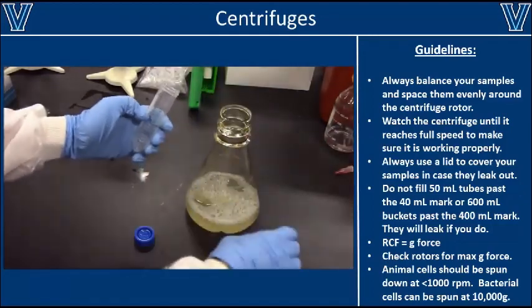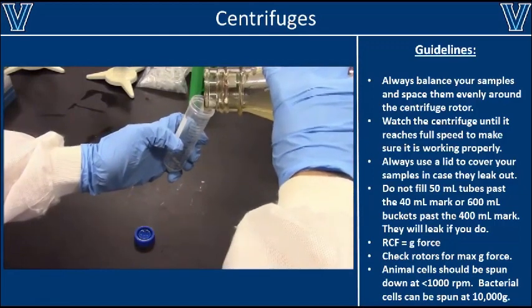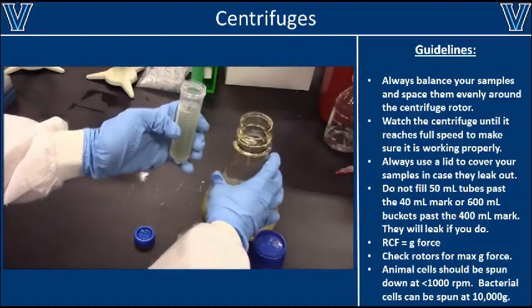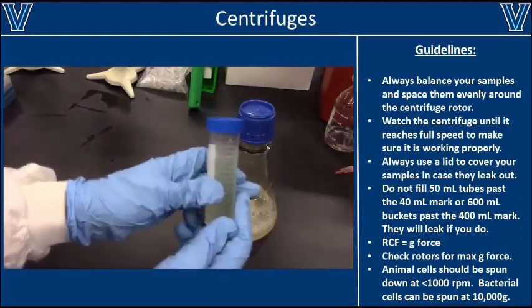Whenever you're using larger centrifuges that use buckets or 50 ml tubes, it is important that you only fill them up to about 80% of their maximum volume. For instance, here we're only filling up the 50 ml tube to 40 ml.